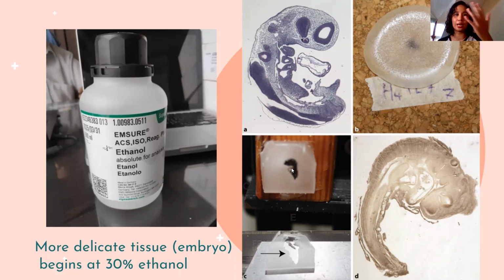And look at the arrangement of the embryo. Ganyan yung paglapat sa kanya, tapos nilagyan ng mold, para nung tumigas yung mold, andito lang yung embryo, okay?